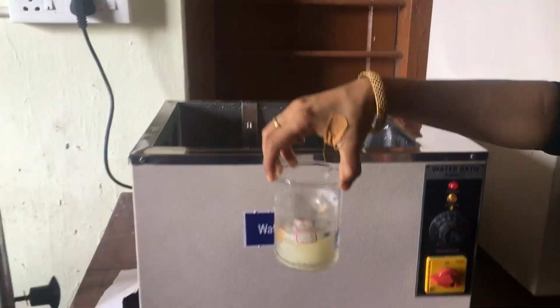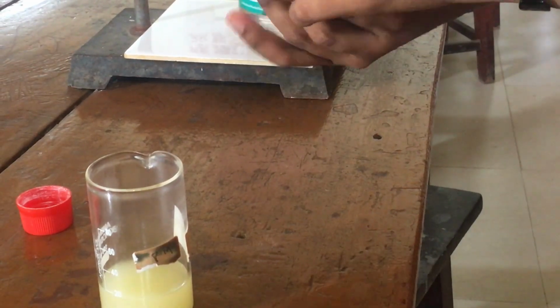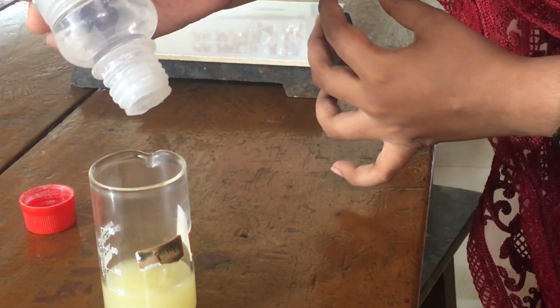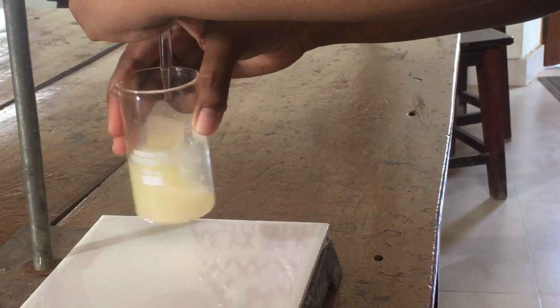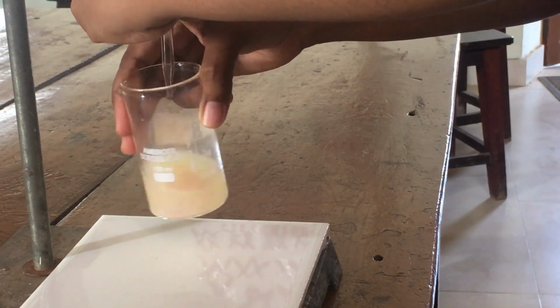Now it is completely melted. We can clearly see this. Then we are going to add phenolphthalein indicator, 2 or 3 drops, and next titrate it against 0.1 normal KOH, and we know the endpoint is the slight pink color.